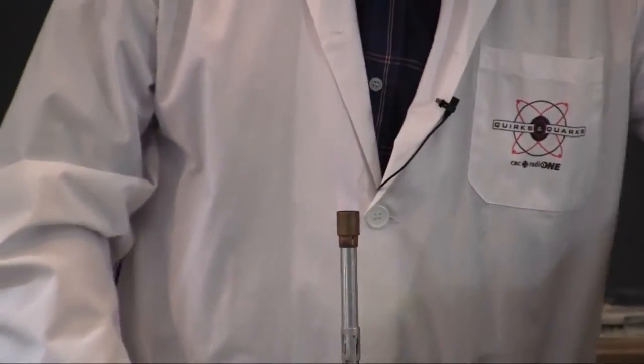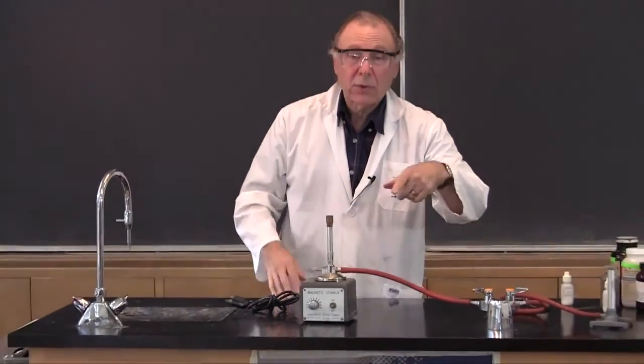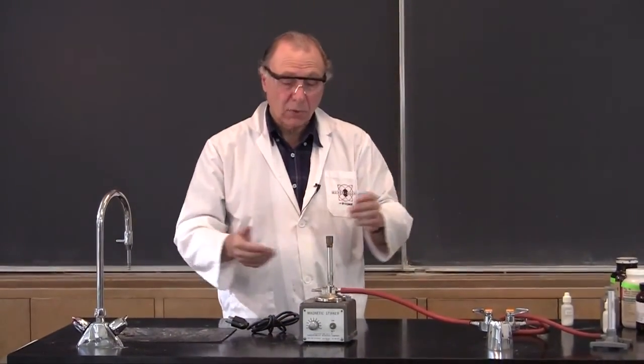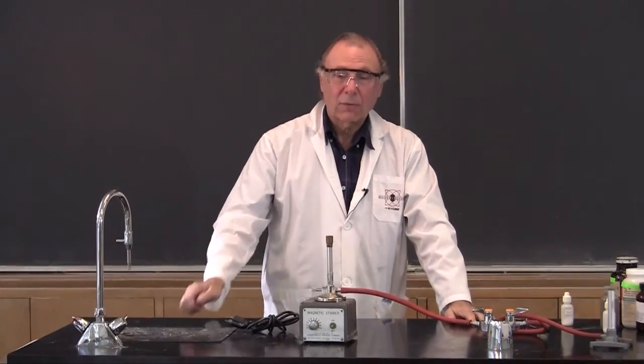Another way of demonstrating flame test, you could do this maybe after a unit, and you can bring in other salts as well, your sodium and barium and strontium, and I hope that you find this useful.